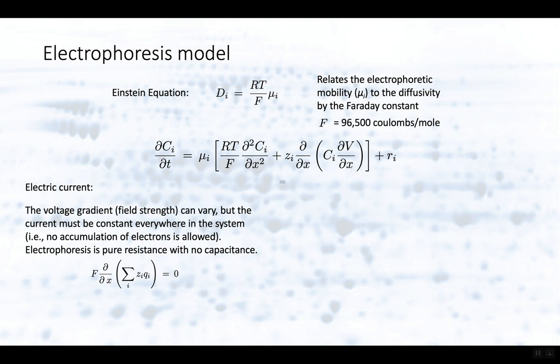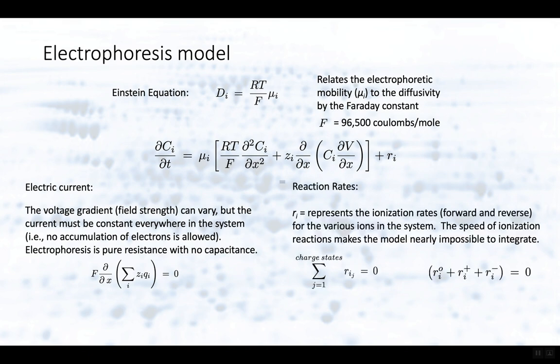Okay, so you have to provide cooling to electrophoretic processes that limits the scale that you can run them. So it's something we always have to worry about if we're doing electrophoretic separations. I don't dwell on it here. We dwell on it a lot in the book.